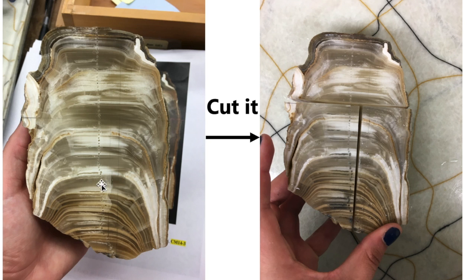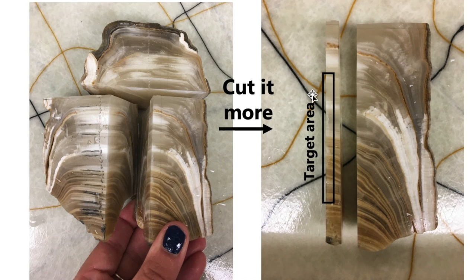So first thing is I cut and I polish my sample, and what you're seeing here on these dots are hand-drilled oxygen isotope measurements that I made essentially with a dental drill, but we can ignore those for now. Because the SIMS measures such small scale, remember those 10 micron analysis pits, I need to cut the sample to be a very small chip. So here I am slicing it. And you need to cut it even more. So here I've sliced it again, and my target area is down the central growth axis, right up the sample, and I've highlighted in this box exactly where I want my targeted area.